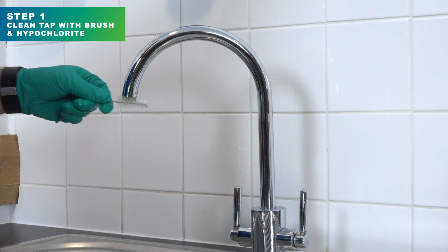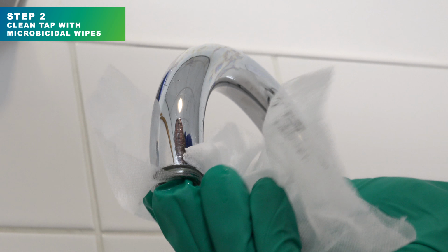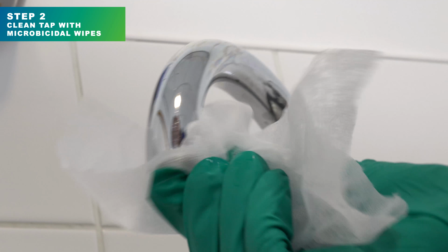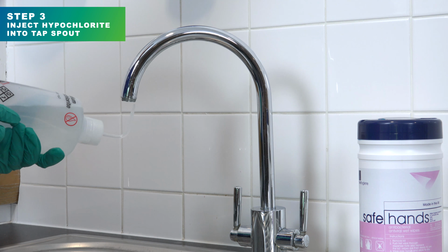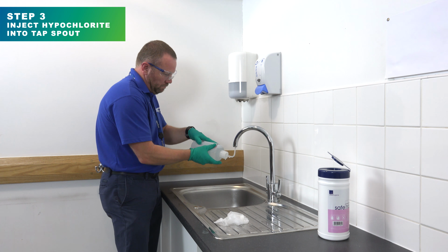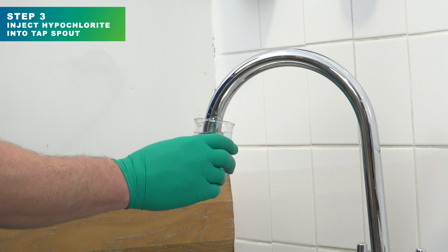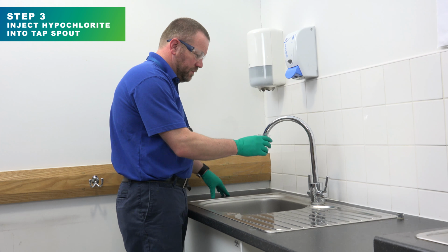Step 2 involves supplementing the hypochlorite disinfection by wiping the inner and outer surfaces of the tap with a microbicidal wipe impregnated with a 70% solution of isopropyl alcohol. Step 3 requires the use of a wash bottle filled with 1% sodium hypochlorite solution to spray the outside of the tap and also to inject the solution up inside the tap spout. If the tap does not allow spraying up the spout, you can instead fill a small beaker with a hypochlorite solution and immerse the end of the tap within this for a minimum of 30 seconds.